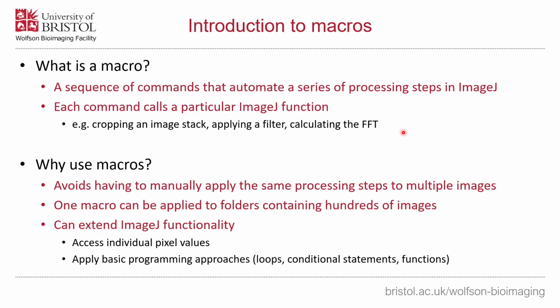One example of this is later on we're going to be looking at detecting different objects and then measuring their nearest neighbour distances. That's quite a custom analysis to want to do, involving reading different columns from a results table and making particular measurements and then outputting them in a particular format. It can't be expected that ImageJ is going to have all of those different capabilities pre-programmed as macros.